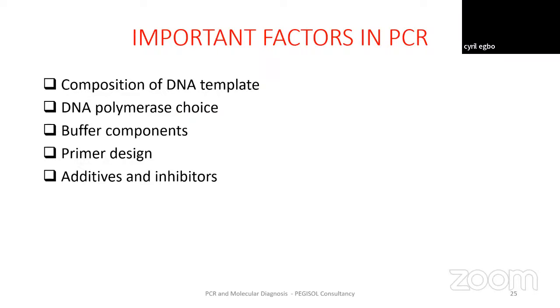So there are important factors that actually affect this PCR process, and which we need to take note of in order to avoid false positive or false negative results. These are some of the factors that may interfere with your PCR process. The composition of your DNA template.